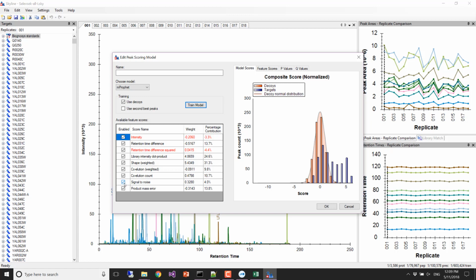Retention time's a little bit stronger predictor, and the coefficients and what is important is not that different from the low CV model, but the big difference is we have this whole other distribution that is essentially equivalent to decoys. So we still can't measure a lot of things.